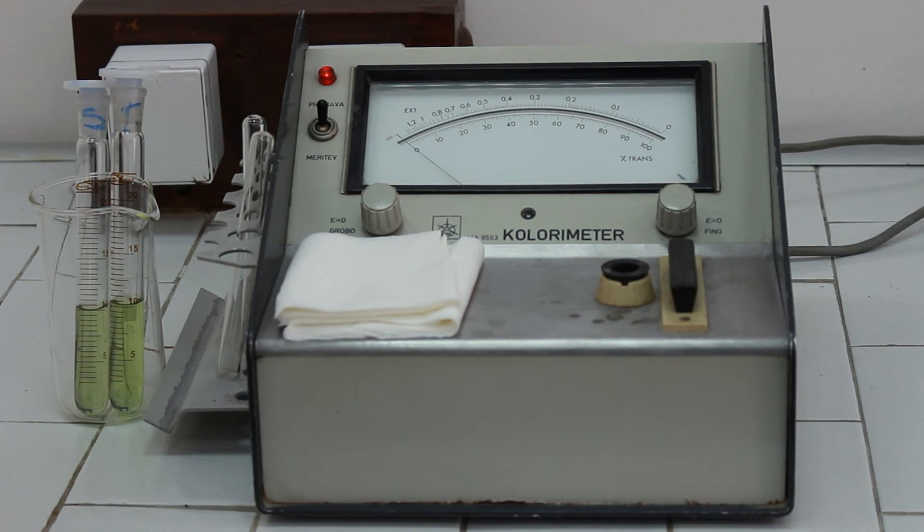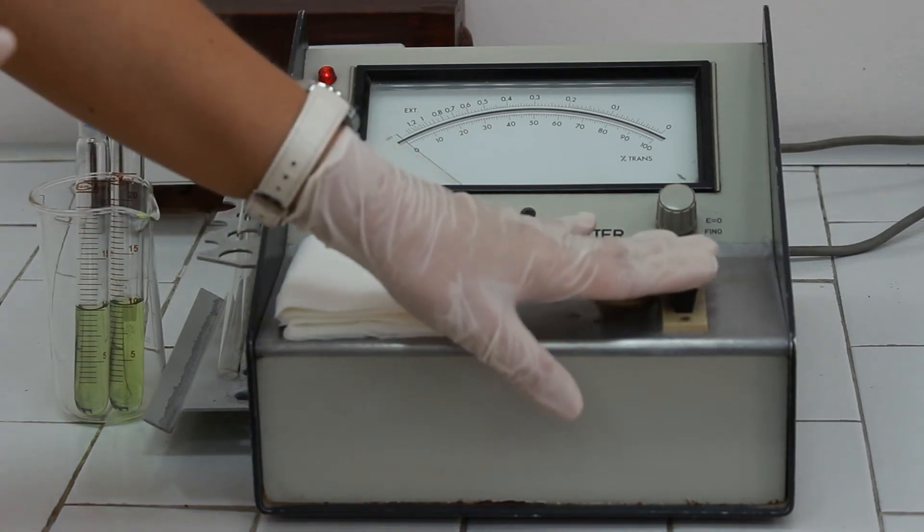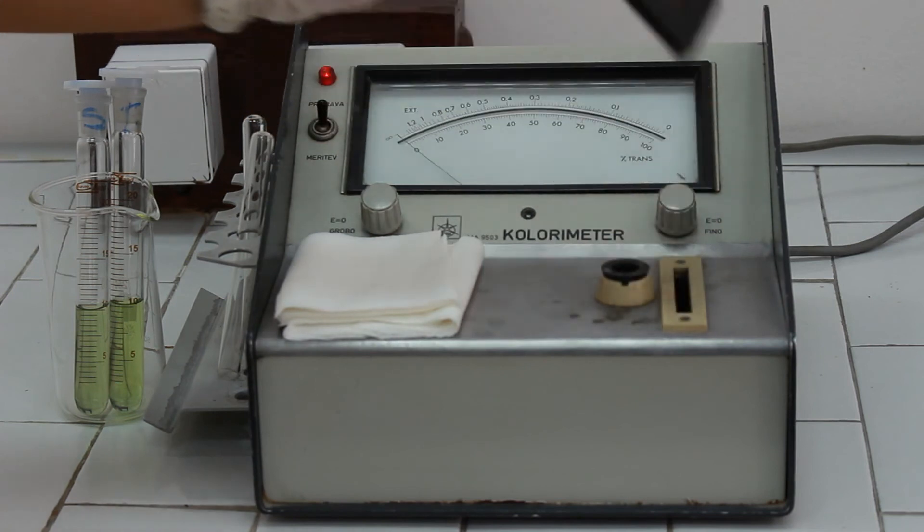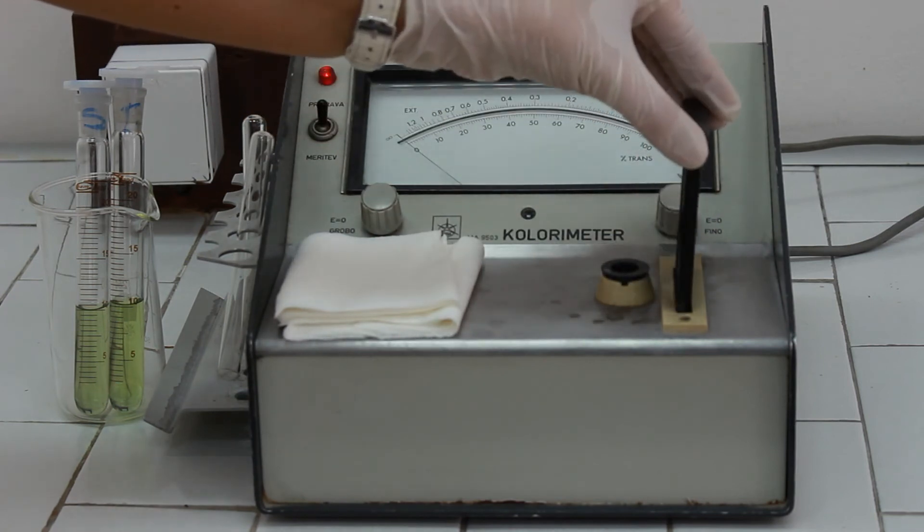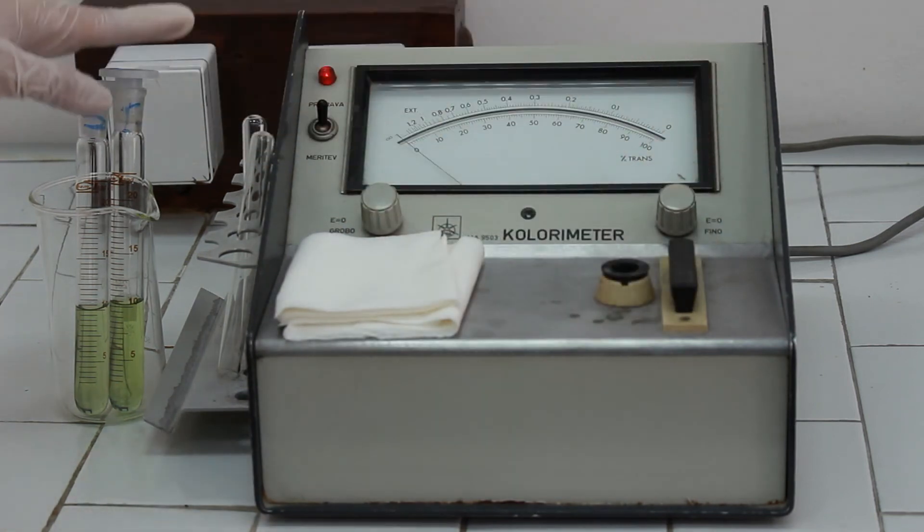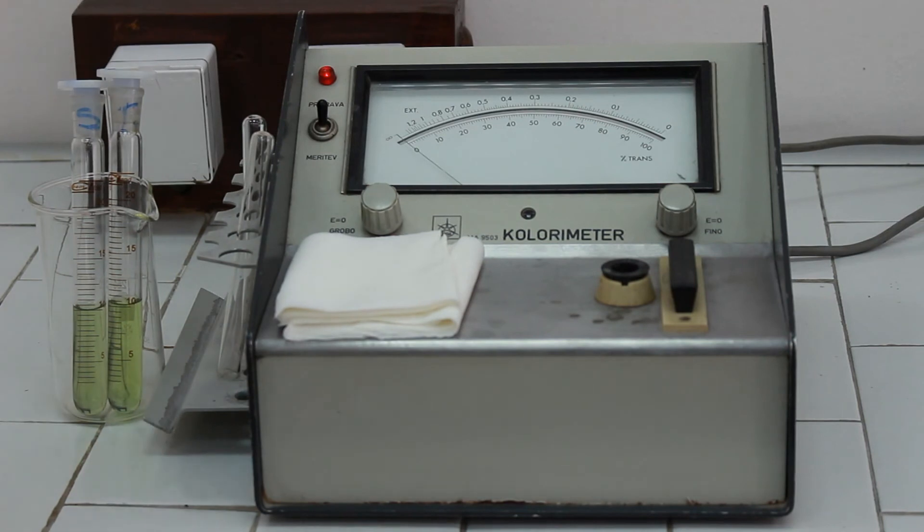Photometer possesses a lamp which emits a certain intensity of light. But we are unable to determine the specific wavelength that we want to deal with. We just need to pick up the proper filter which is chosen here. Since we are dealing with the green colored solution, we are going to use and pick up the red filter.